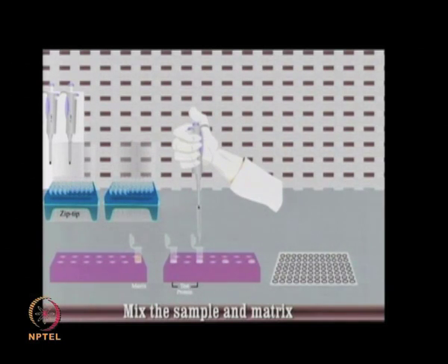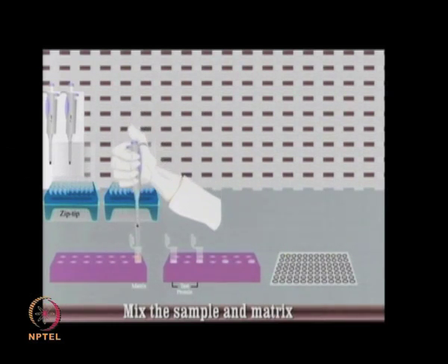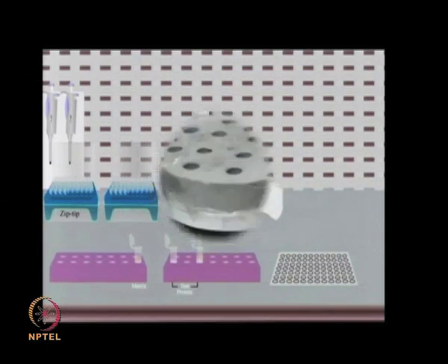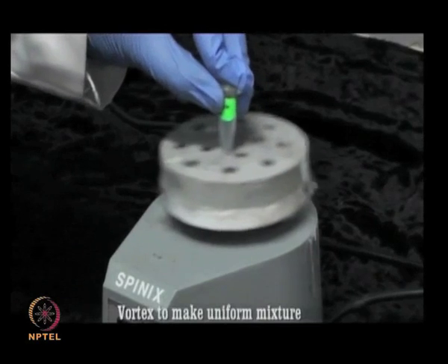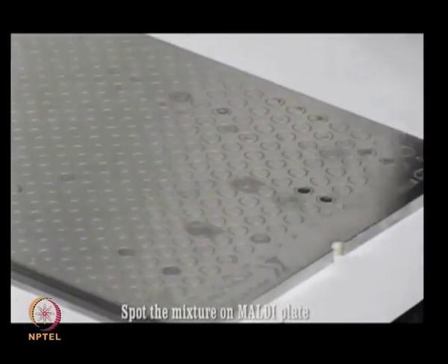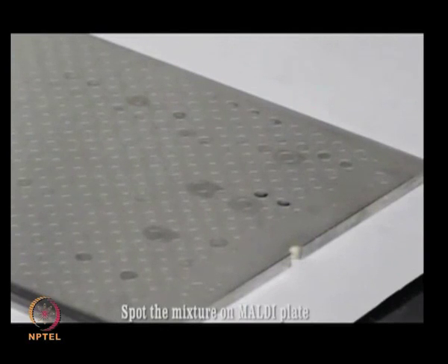MALDI is performed in two steps. In the first step, the compound for analysis should be dissolved in a solvent containing small organic molecules known as matrix. This mixture is dried before analysis, and the liquid solvent used in the preparation of the solution is removed. So, in this video, by depicting the matrix preparation as well as instrumentation, we will try to give you an overview of the MALDI TOF instrumentation.